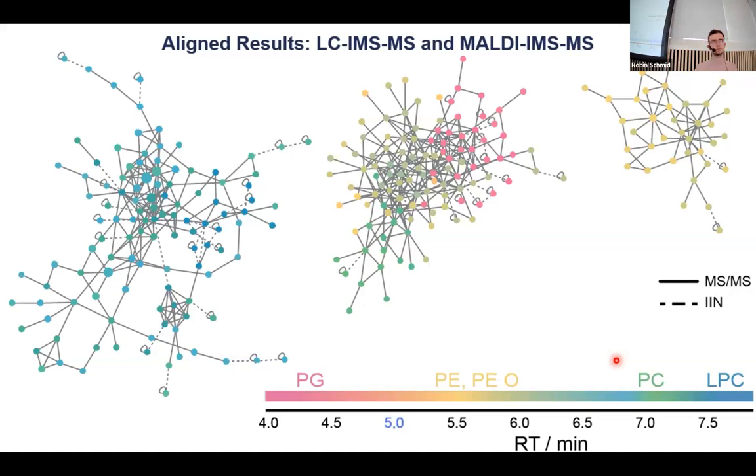Yeah, maybe to focus here on IMS. Who is thinking about using IMS in the future? Okay, there's a few more people. And I think Alan, at least if I got him right in this slide, was putting the Orbitrap or the Q-TOFs more on the left side, on "we want to discover new things," and then the timsTOF he put kind of in between verification and finding new things. And that's also where I would place it.